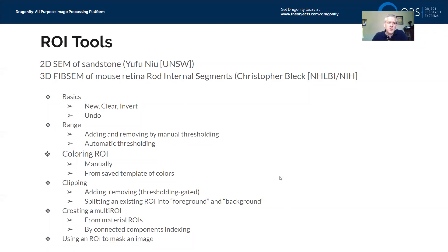We're going to be using two different data sets today. First, we'll look at a 2D SEM image of sandstone, which we'll find in the Digital Rocks Portal — this comes from Yufu Niu at the University of New South Wales, a member of Brian Armstrong's group. We'll also be using a 3D FibSIM data set and a segmentation of mouse retina rod internal segments, from Christopher Bleck at NHLBI.